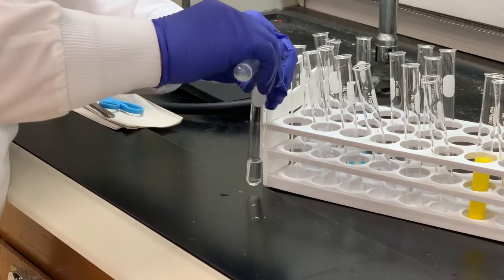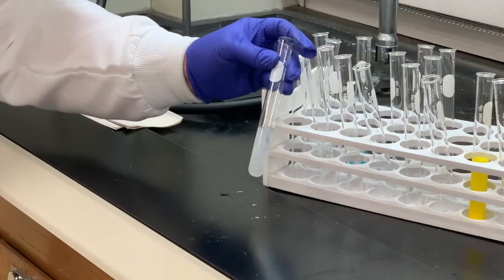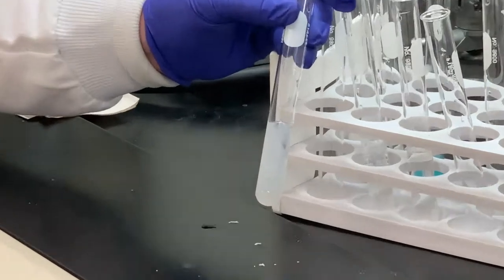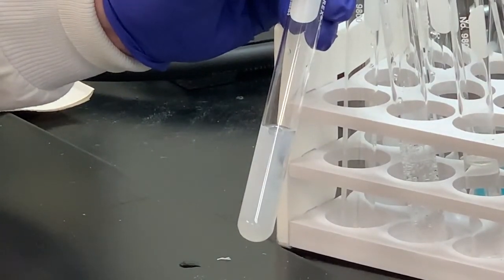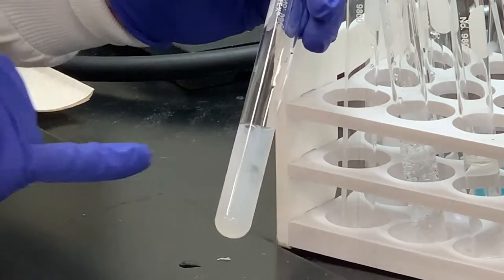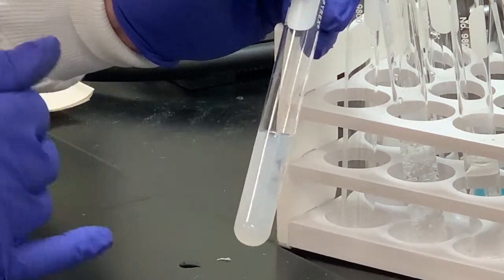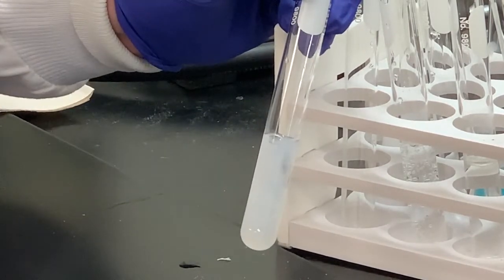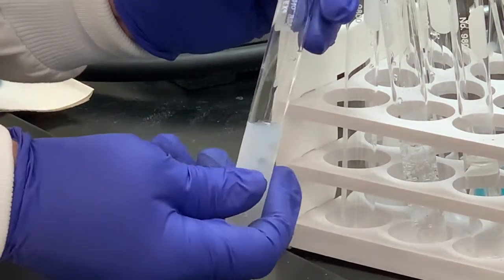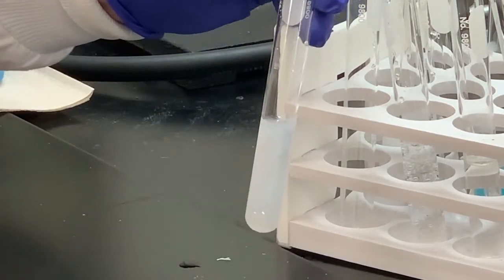We'll add one to the other. And notice we did form a precipitate. This particular one almost looks like a gel formation to me. I don't see any bubbles rising to the surface. It may be likely there may be a bubble or two that's trapped in there just from mixing, but I'm not seeing any stream of bubbles rise to the surface. I don't notice a temperature change, but again, we did form a white precipitate.